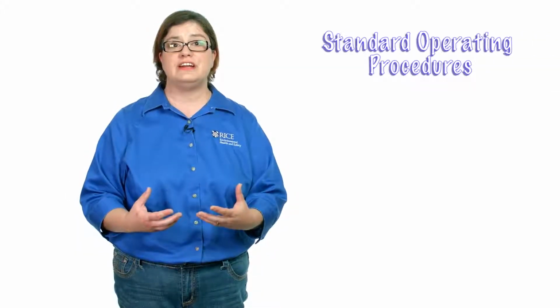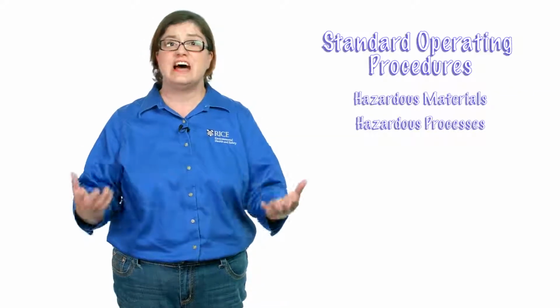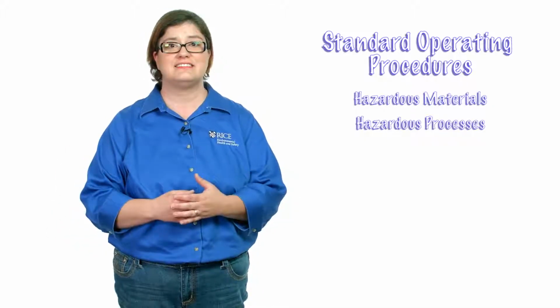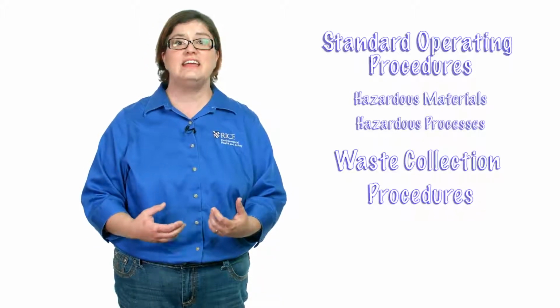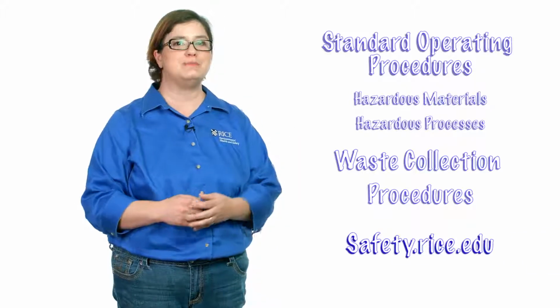Another important administrative control is having and using standard operating procedures. You want to use a standard operating procedure anytime extra training is required, as well as extra approval for hazardous materials or hazardous processes. One of the standard operating procedures that we'll talk about today is going to be the procedure for waste collection. A template for standard operating procedures is available on our website.